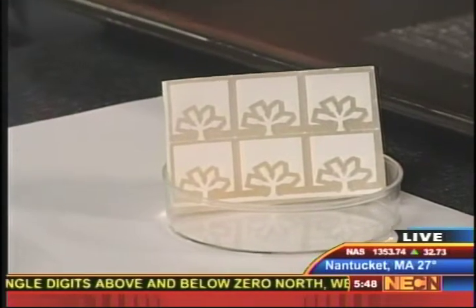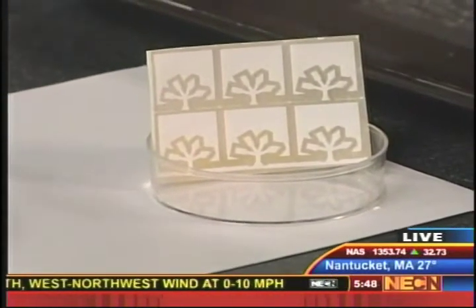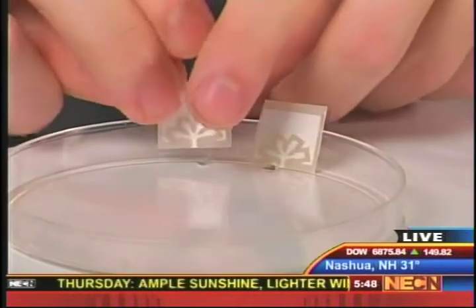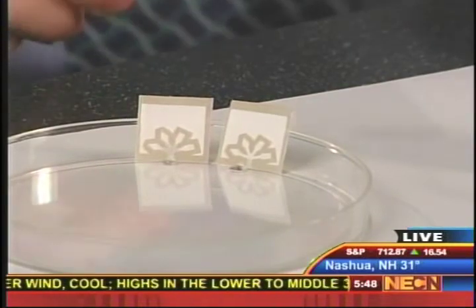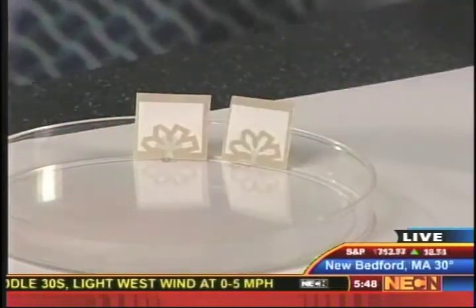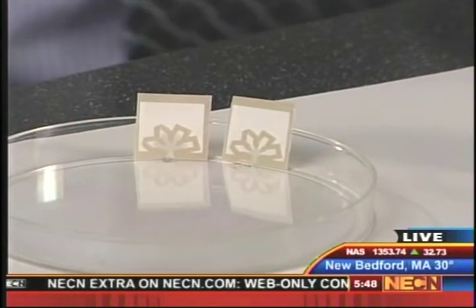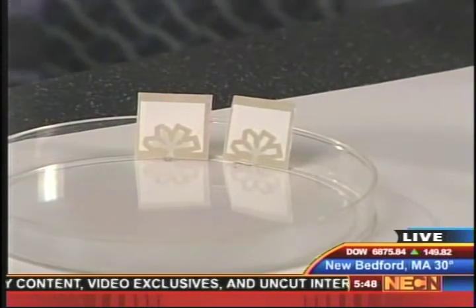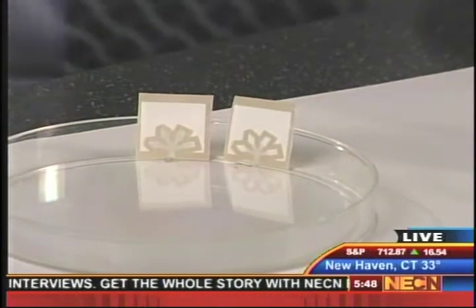Okay, let's see that. Can you see that right here? Yeah, but I can't quite make out the colors. Oh, that's right. So if I start this up, I'm going to run the test right here, and I've got 2 drops. So the drop to your left contains only water, and the drop to your right contains both glucose and protein. So it should change the color of all the test strips. Okay, beginning to see some color on the right, but not on the left. I hope that's the case. And so basically, you can see it's happening really fast. The fluid runs right up the channels and into the wells where it reacts with the chemicals.